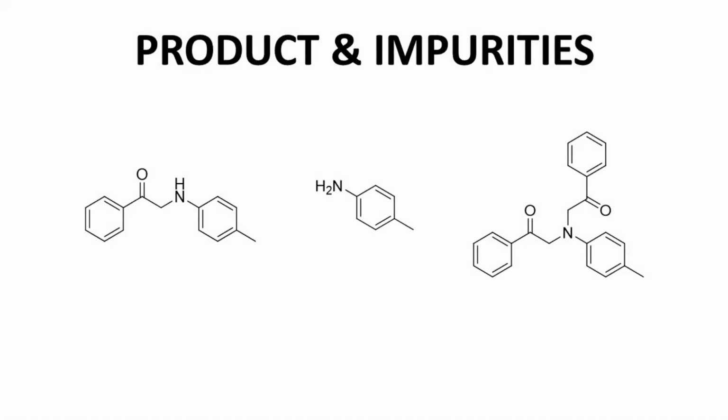I said that I would identify at least what I think this impurity is. And so here are 3 compounds on the screen. On the far left is the star of our show. That's our product, and by far the majority of what we see in our data reflects that molecule. I initially thought, based on the data in the NMR spectrum, that we probably had a little aniline.